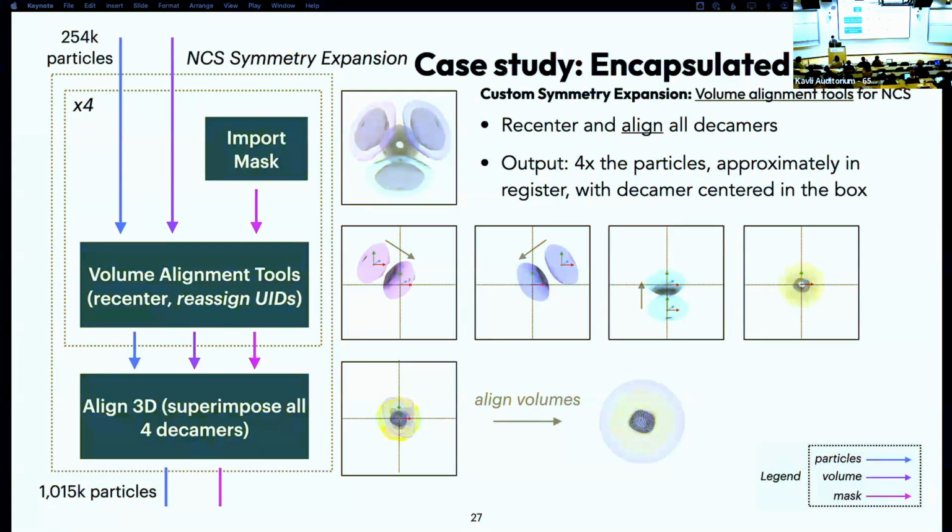I think in this case, it's interesting that, like you said, there has to be something that's holding the cargo inside the shell in some reasonably conserved arrangement for it to even stay in a tetrahedral packing inside. And if it's away from the shell, there must be some linkers or something. But clearly, those parts of the structure have to break both the symmetries of the tetrahedron and the D5 shell symmetry. So it's a very complicated object, but a super interesting case. Yeah.